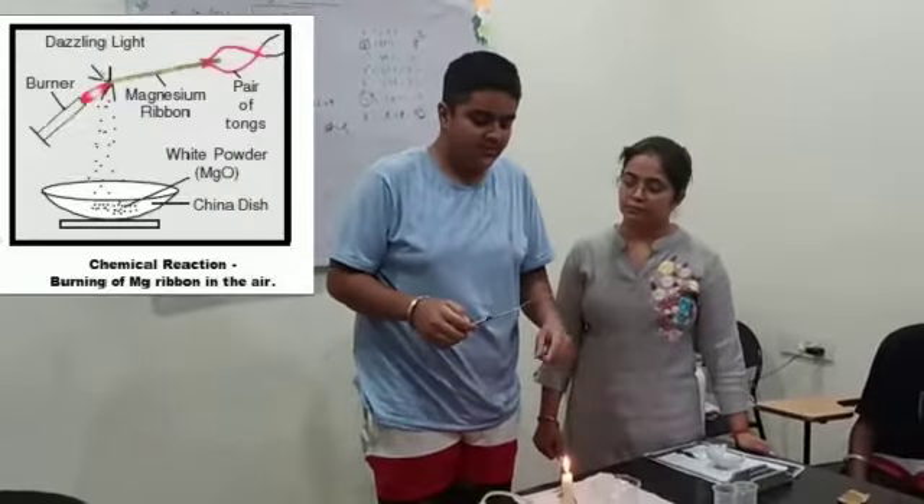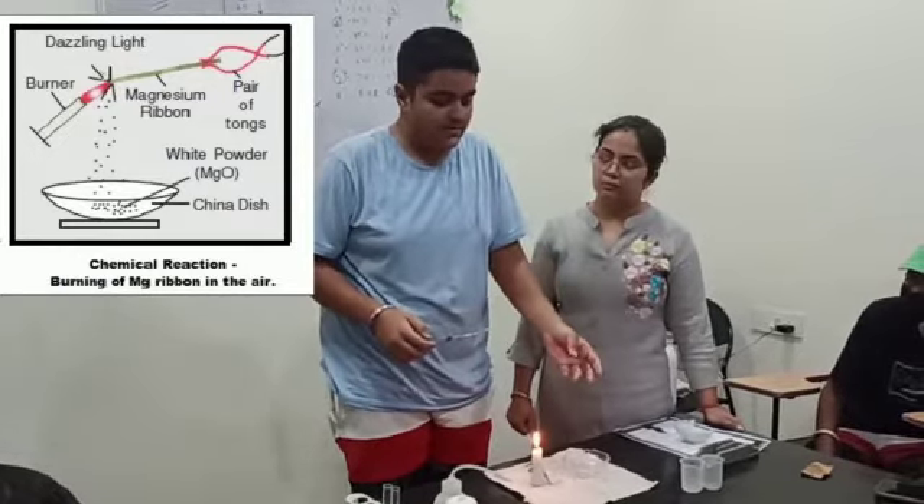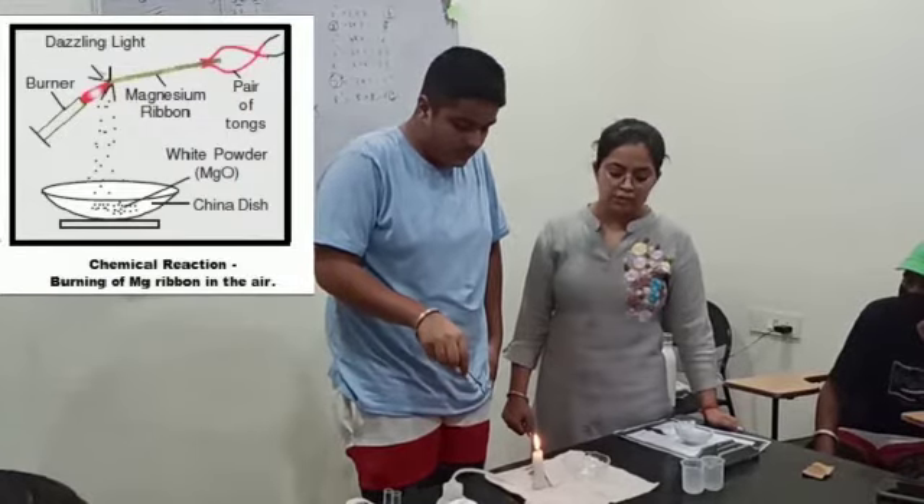This is our magnesium ribbon. We are just burning it and we will have the white powder substance that is our magnesium powder. That powder is magnesium oxide.